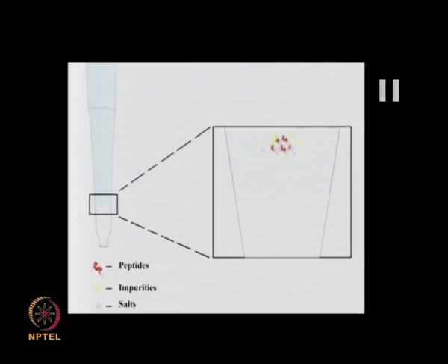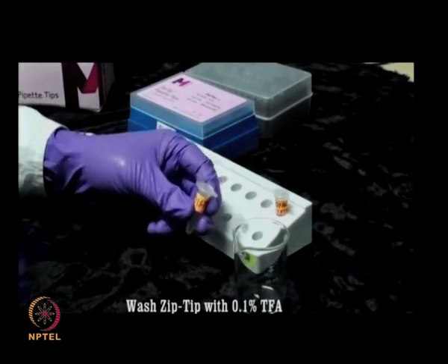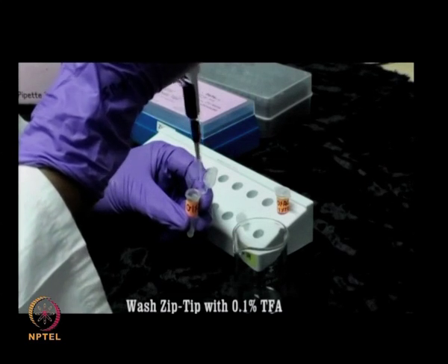First, you need to attach the ZipTip pipette tip on top of a suitable micropipette. Condition the ZipTip with 10 microliters of acetonitrile. Perform the wash step 3 times, and wash it with 0.1% trifluoroacetic acid or TFA.